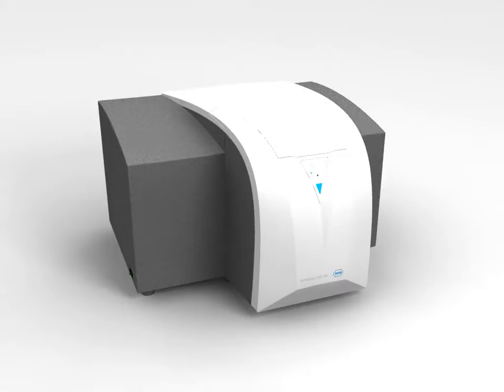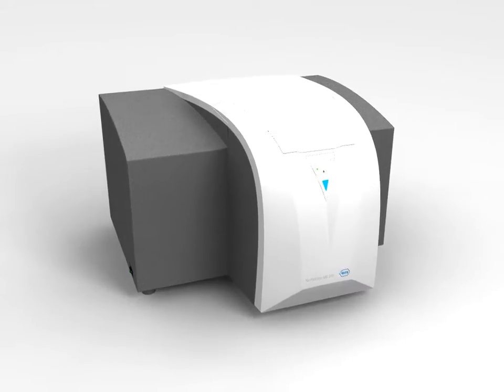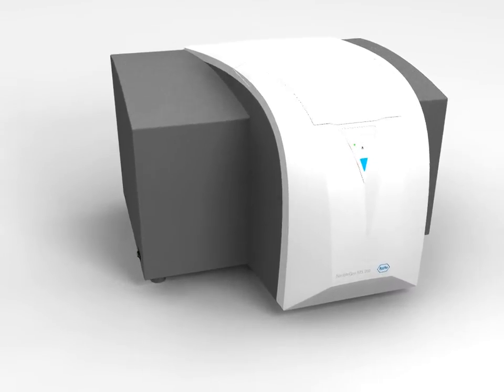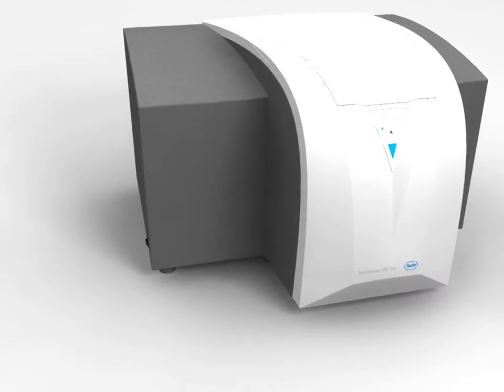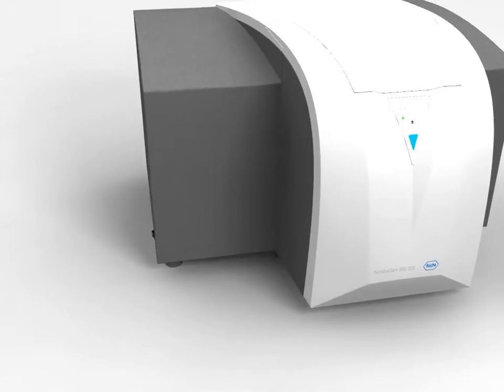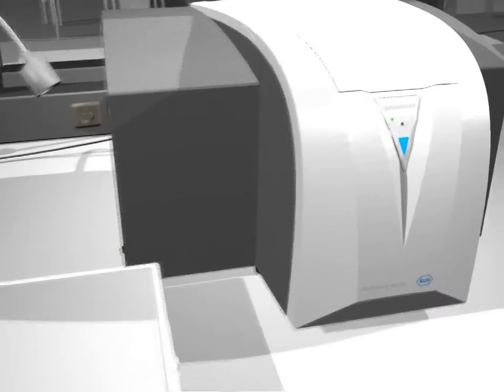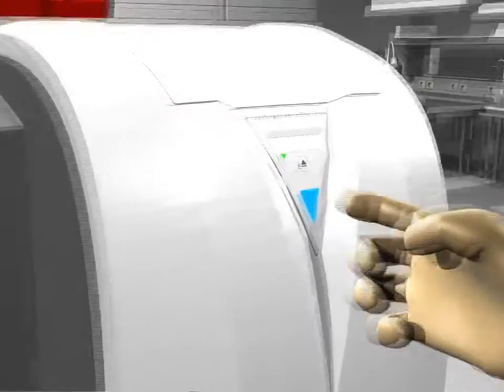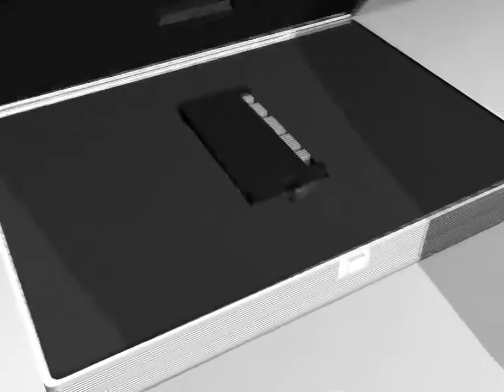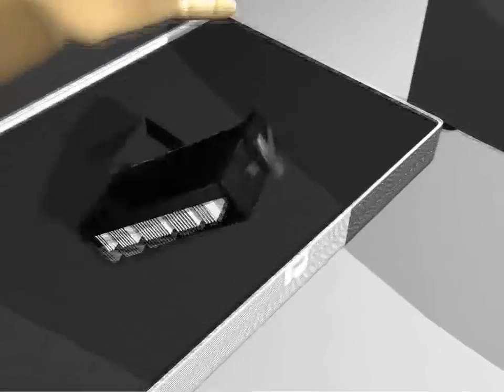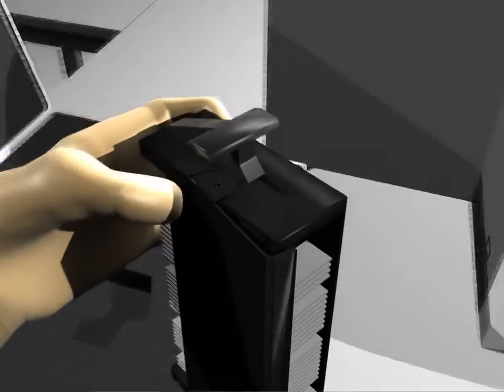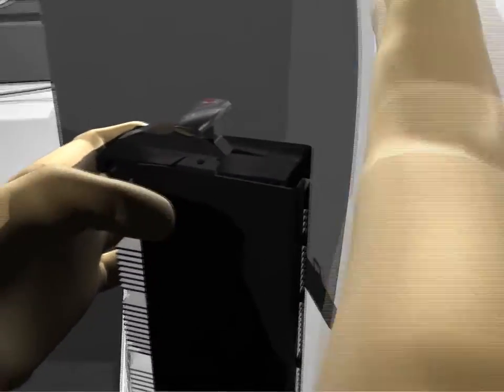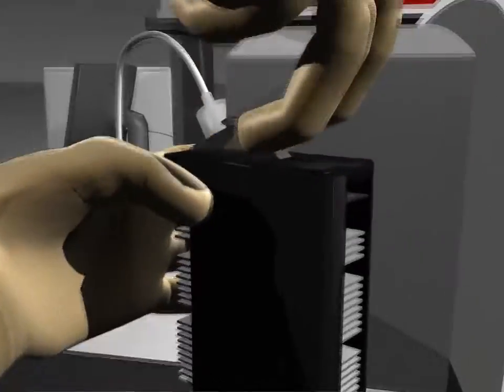The Nimblegen MS200 microarray scanner, the latest generation in microarray analysis, is an intelligently designed, state-of-the-art fluorescent scanner with a 48-slide autoloader and safety features.